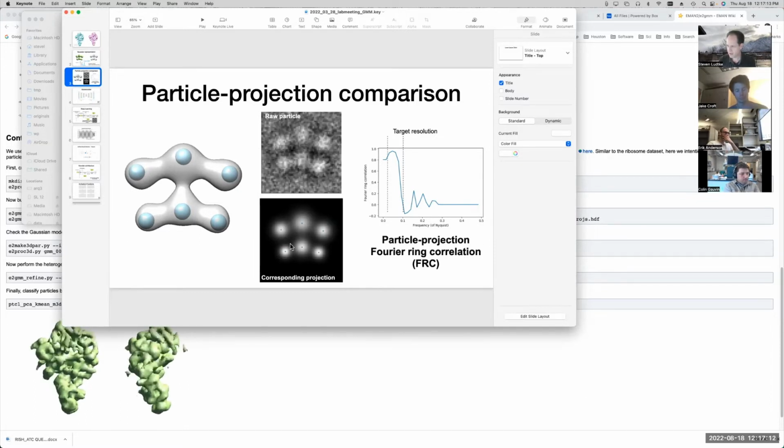So you make a 3D map basically from all of the data, which is going to include any blurring or anything else that might be around. And then the 3D Gaussian model that you start out with will be built on top of that. And we call that the neutral model, right? And then the motions of the Gaussians are treated sort of like perturbation theory in physics, if you ever got that far in physics, but it's basically their deviations from those neutral positions that you got for the overall map.